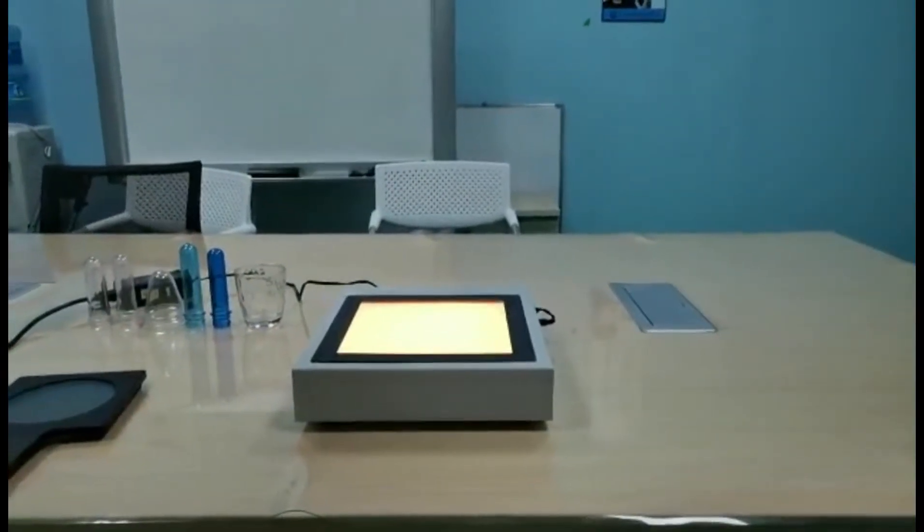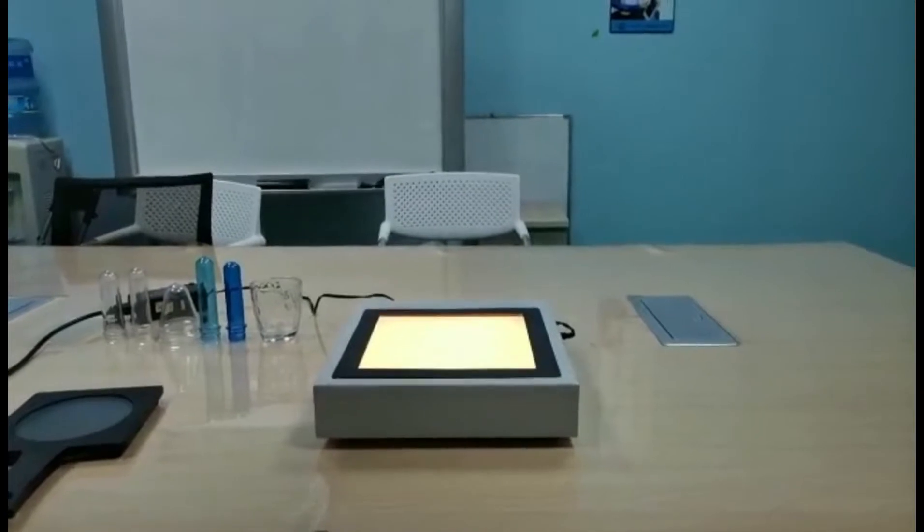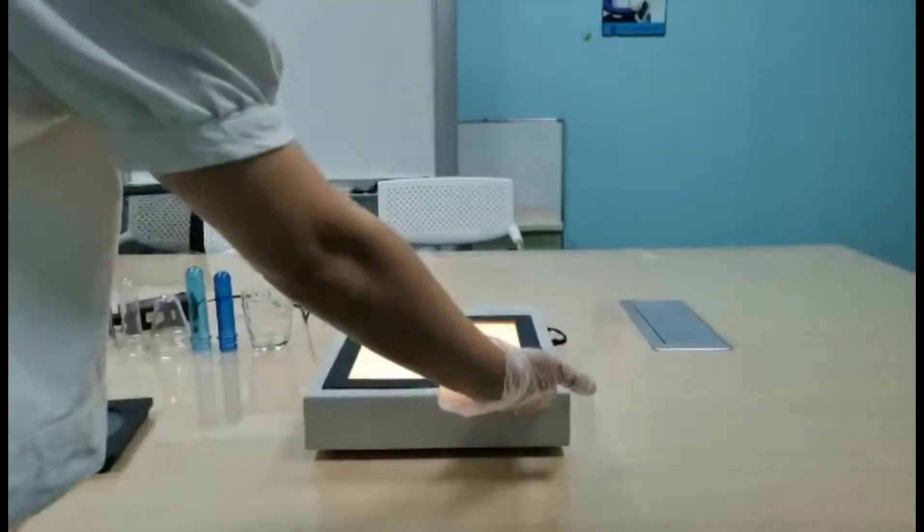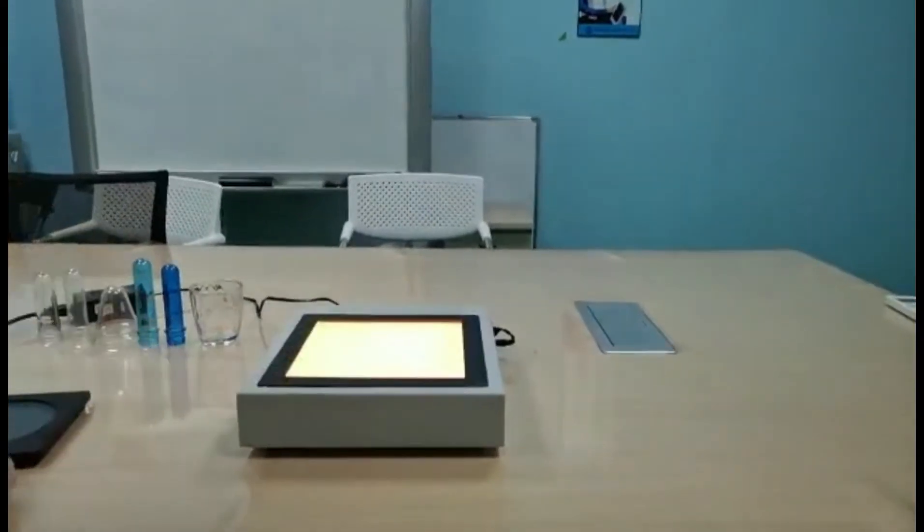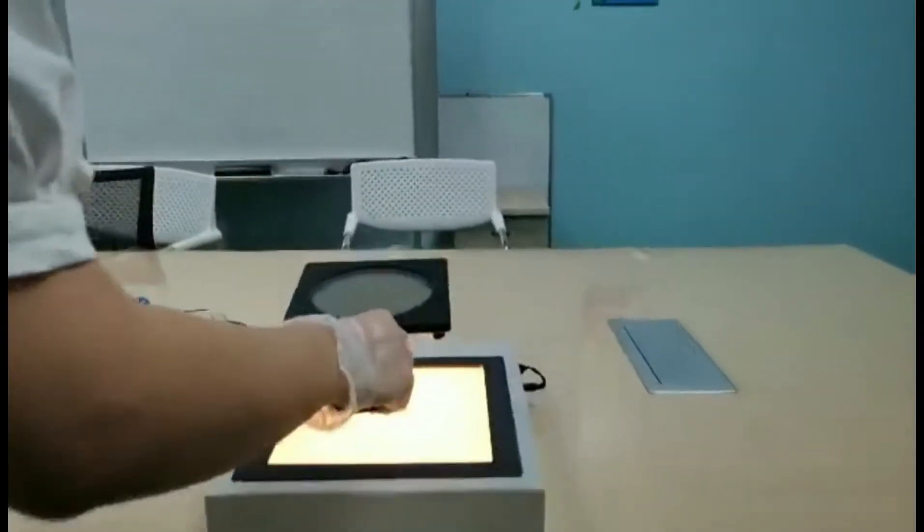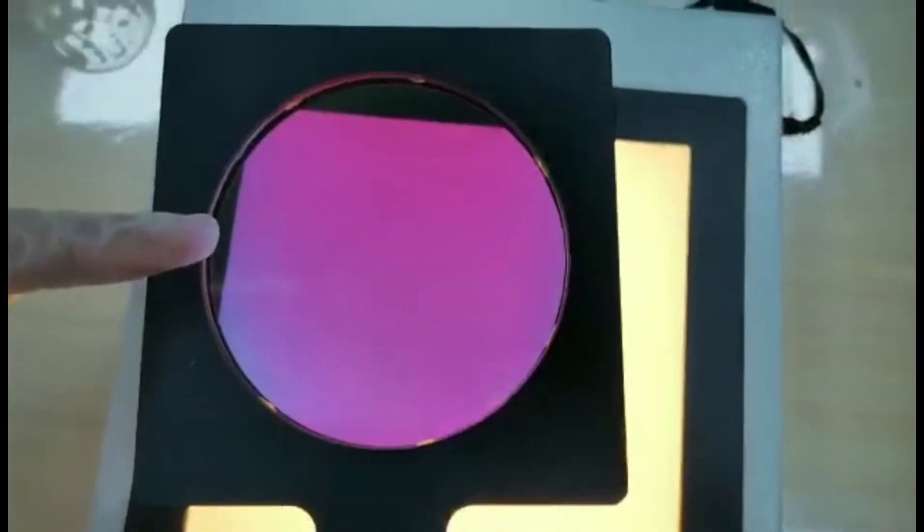One obvious advantage of this model is the flexible installation. The polarizer can be placed on the table in this way. When we see from the analyzer on the top, the field of view turns orange-tinted.